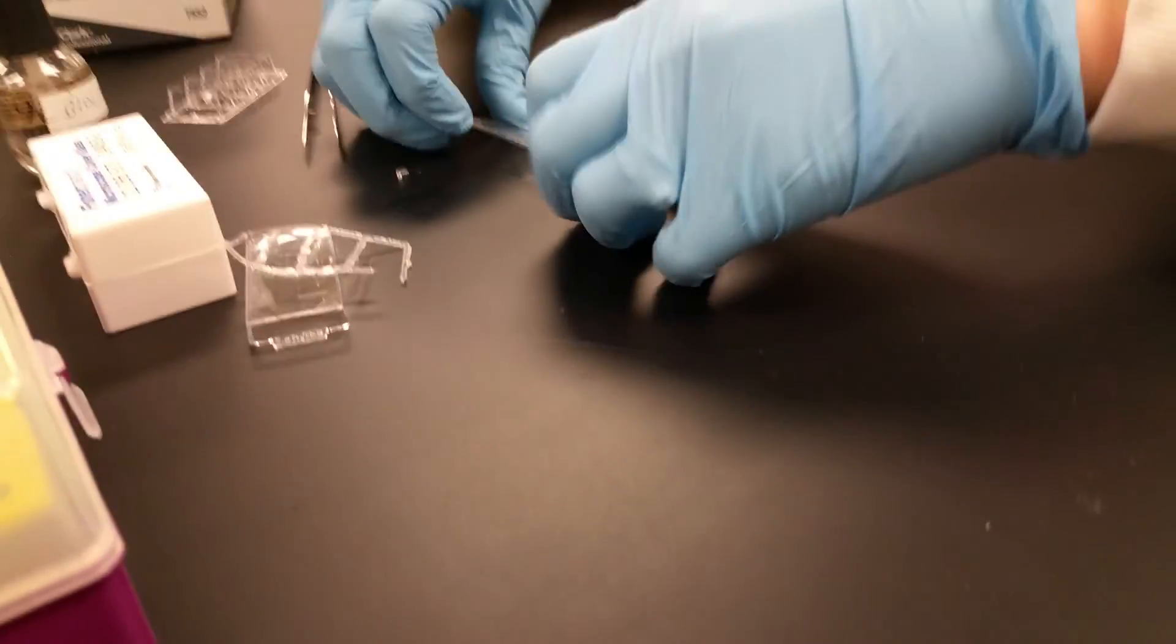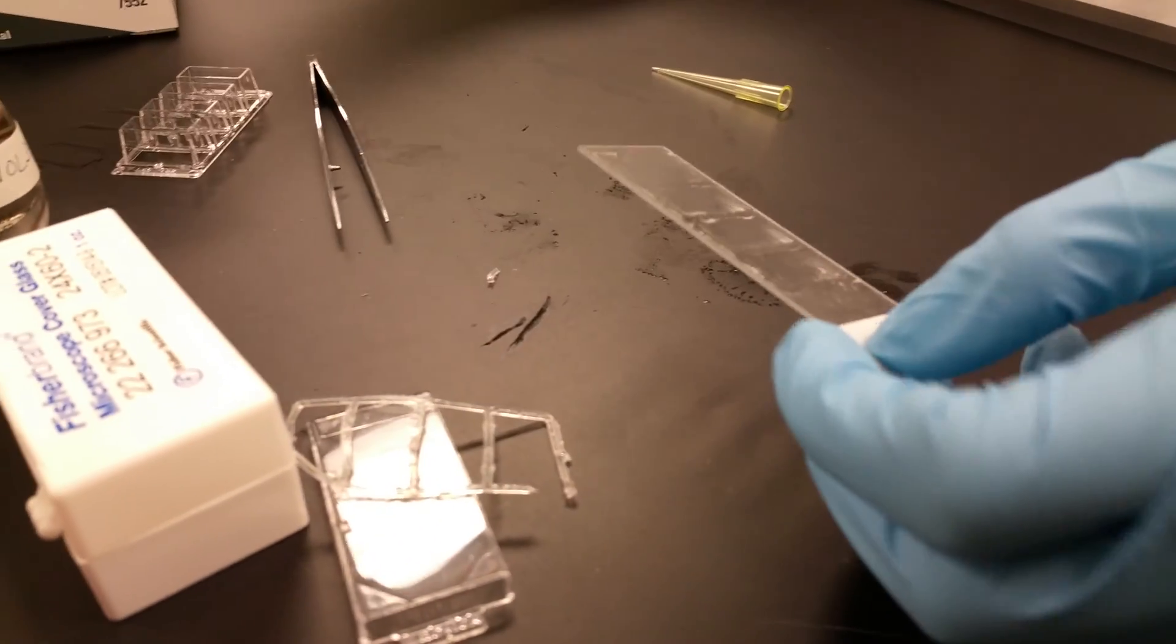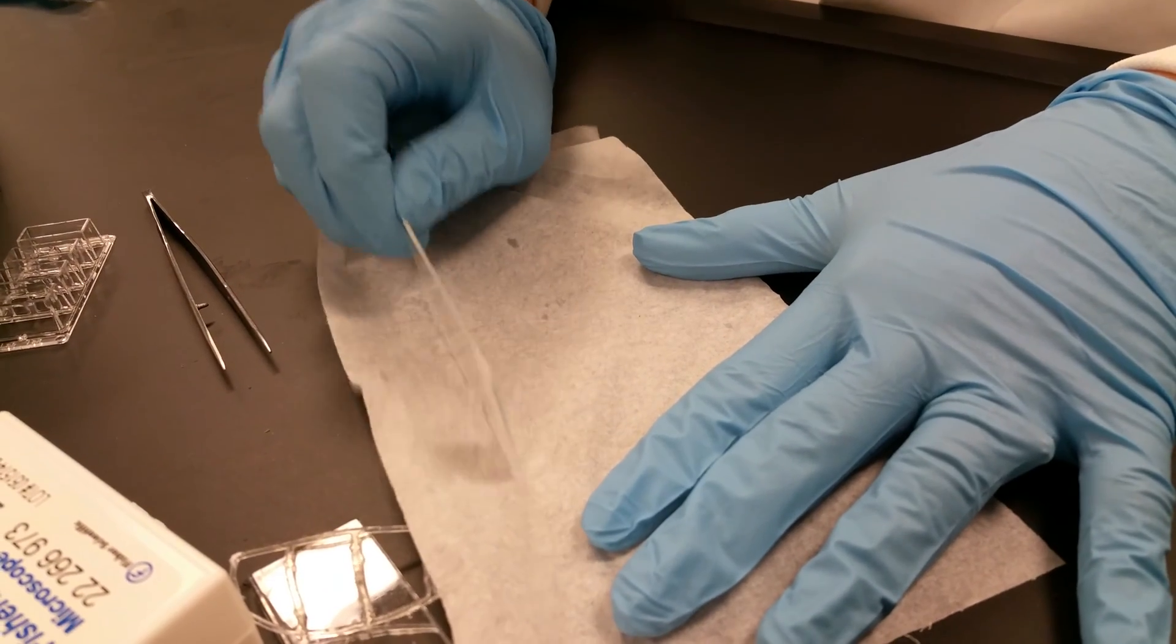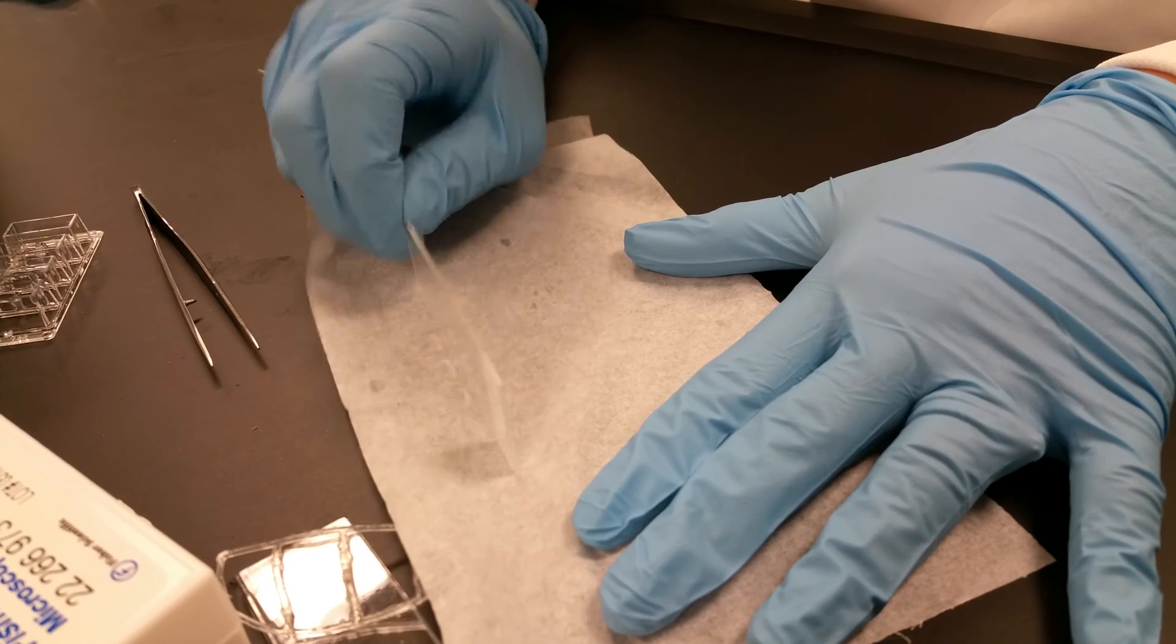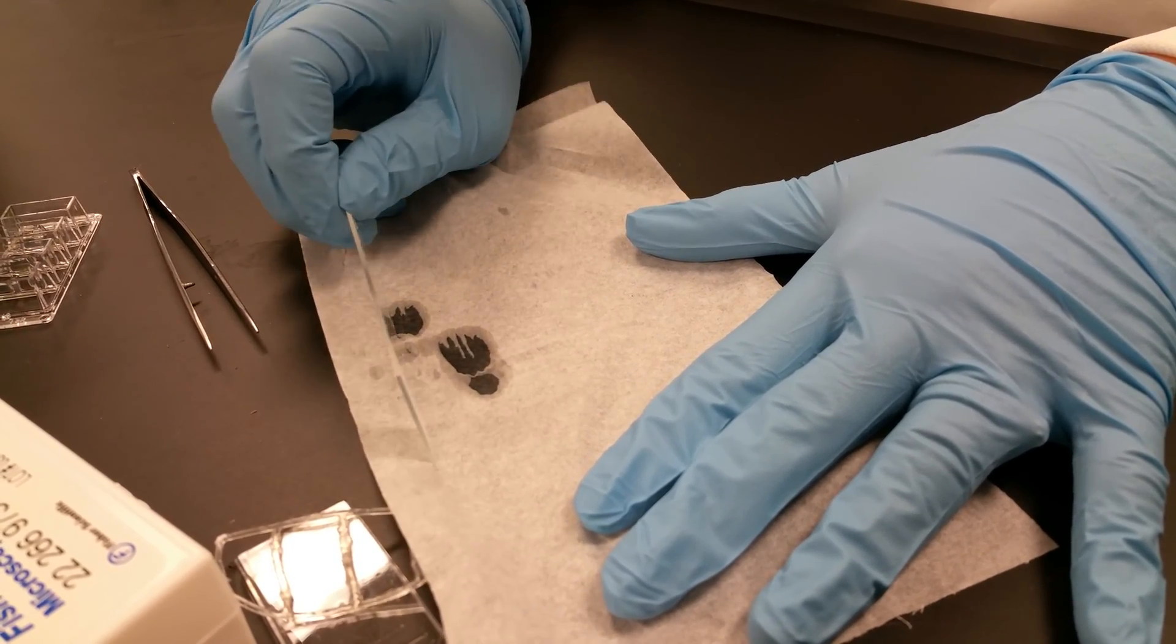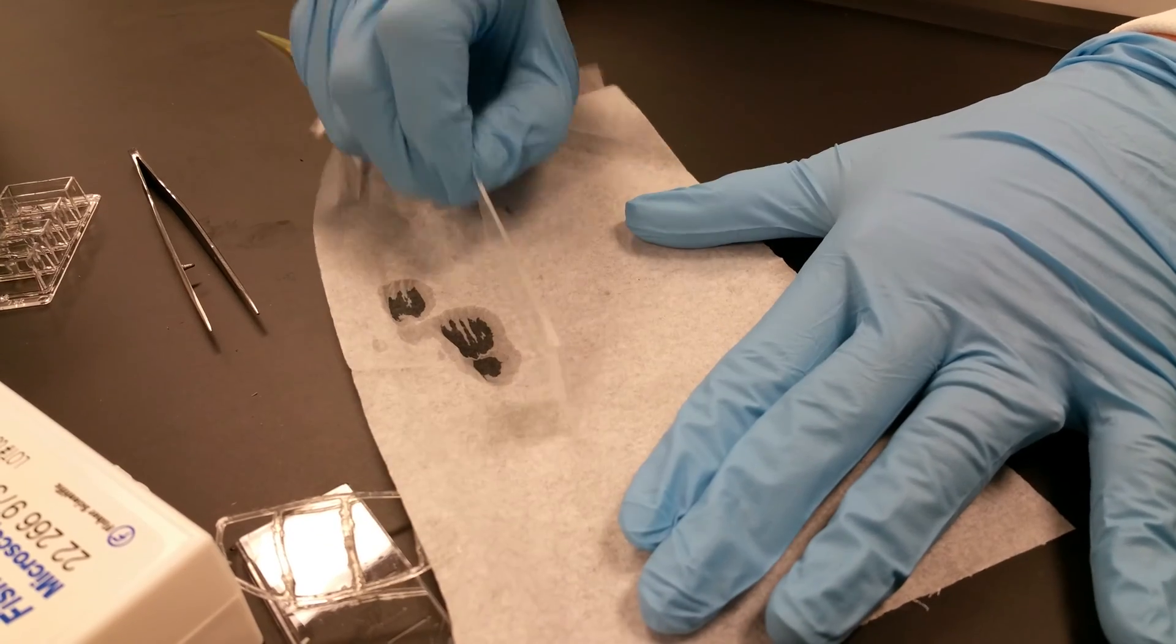Now we are almost ready to put the coverslip on. The last thing you want to do is blot off any excess liquid. You can do that just by tapping the slide on a chem wipe. You see how some of it is coming off? Just let this happen by capillary action. Don't do this because you don't want to wipe your cells off.